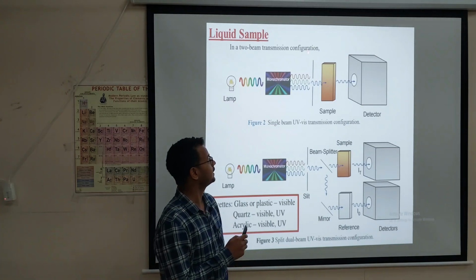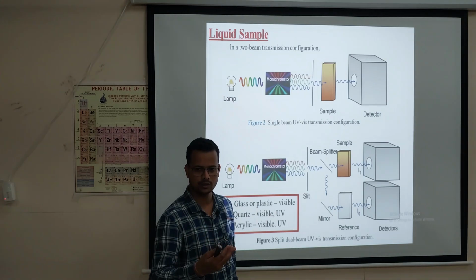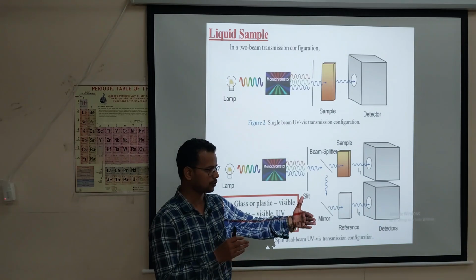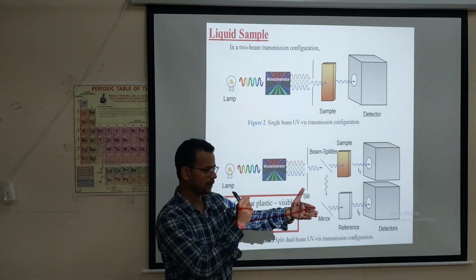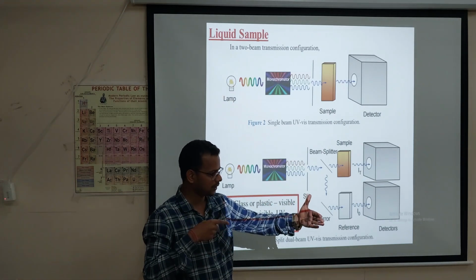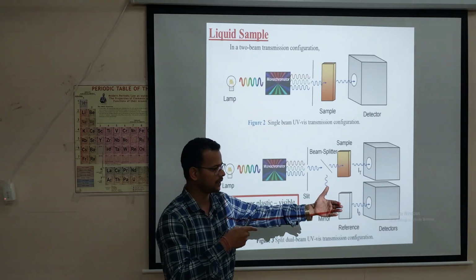So actually, a slit cannot choose which light I will pass. The example I told you: I take a plain or black paper and make a very small hole. Now just light a torch, only a very narrow light source will go through, and if a sample is there, it will strike that.